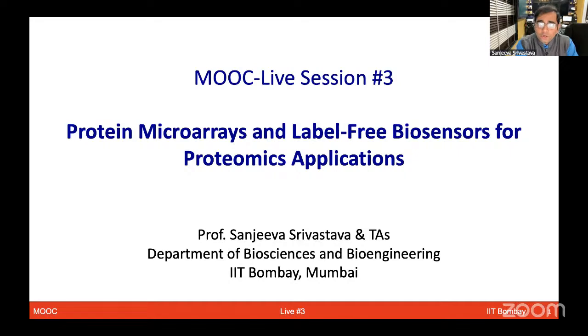Today, we thought not to just give you the lecture, but rather give you some lab demonstrations to give you the first-hand feel of how some of these experiments, which we have been talking about in theory, can be performed in actual lab settings. So the theme for today's live session and the lab demonstrations is protein microarrays and label-free biosensors for various proteomic applications. You have been interacting with Dr. Argya. He is the main TA for this course, and I'm Sanjeeva Srivastava, the instructor for this course.